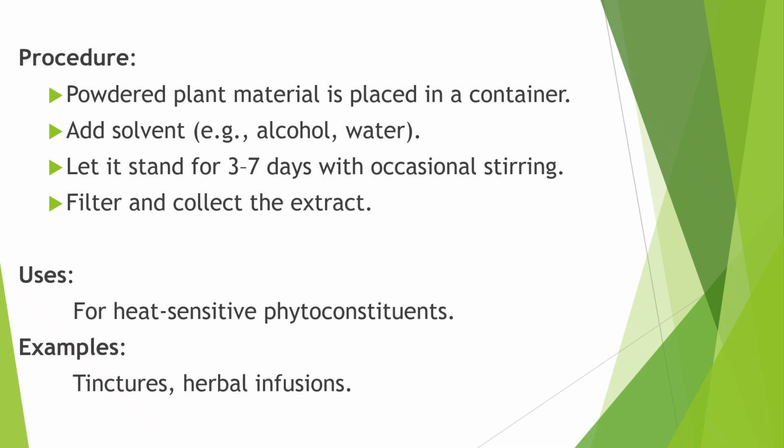Then let it stand for 3 to 7 days with occasional stirring, depending on the process as I mentioned earlier. And last, you have to filter and collect the extracts.